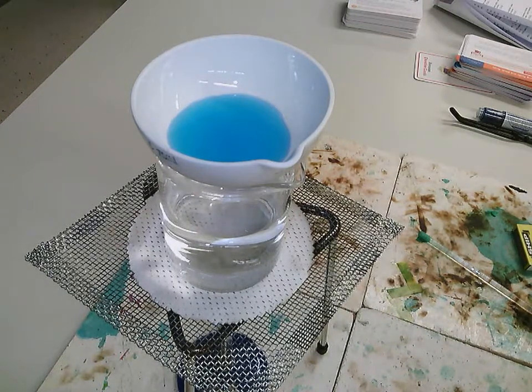That's got water of crystallization. So when it forms diamonds, like when you get sea salt and it forms those crystals, it's actually got water inside the crystals. What we want to do is remove all of that water, and what happens is the copper sulfate actually goes into a white powder. So we'll be heating it now until all that water's turned it into big blue crystals. Then we'll just keep heating it.